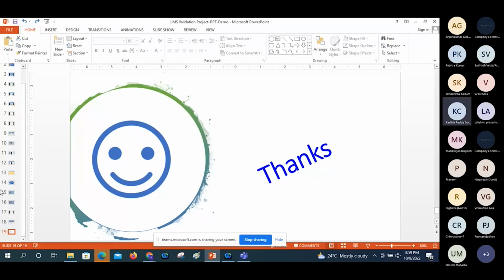Why? Because calculations we need to prepare and configure as part of the master data. So, for example, analysis calculations. For example, there is an assay calculation. The assay calculation we need to put into the analysis, and we need to test it as part of the method execution module. So whether we can put dummy results. For example, let us say a volumetric solution calculation. There is a 0.1 normal HCl. The 0.1 normal HCl calculation we need to put.